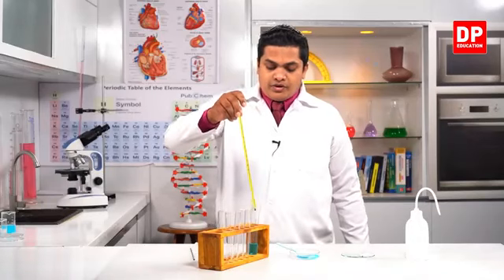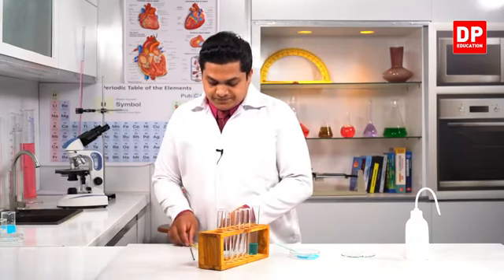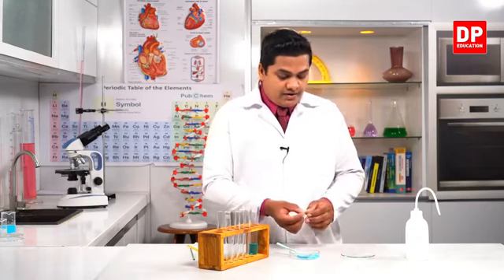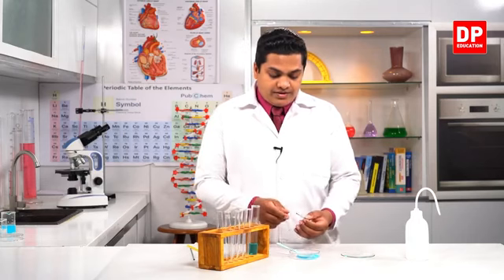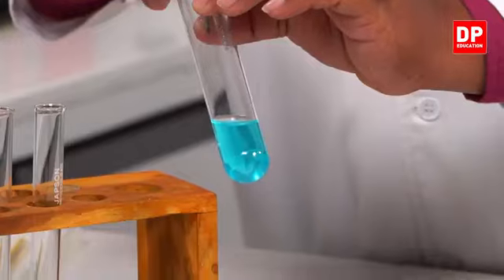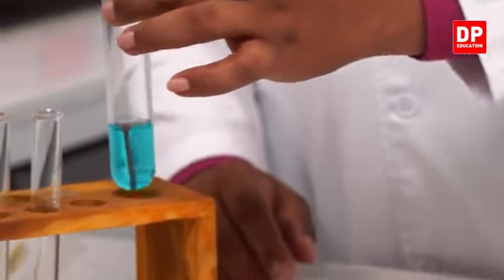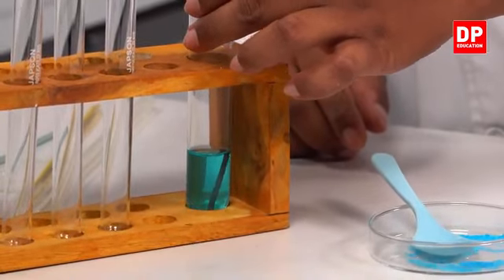Right, now I'm going to insert the iron nail into this container. I have a cleaned iron nail, right? So I'm going to insert this cleaned iron nail into the system like this. Now we'll leave it some time and observe what kind of a change is going to occur in this system.